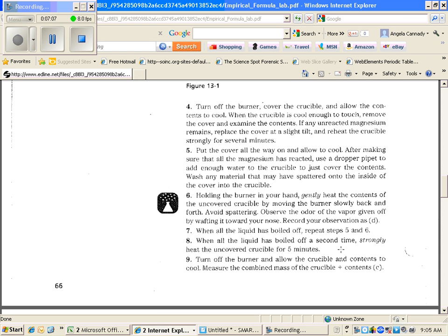So we're again trying to burn off any excess magnesium. By adding the water here, we got rid of nitrogen or carbon dioxide, anything that was in the atmosphere other than oxygen. And now we're going to let it cool. When we let it cool this way, we're going to weigh the crucible and its contents.